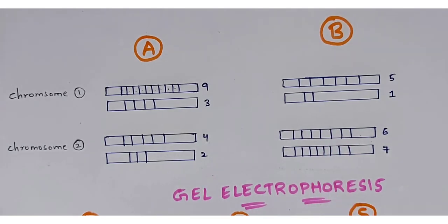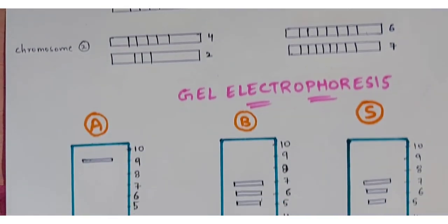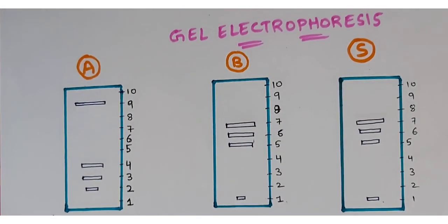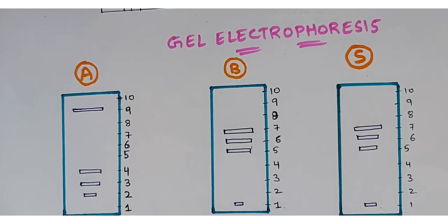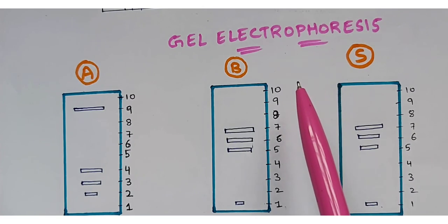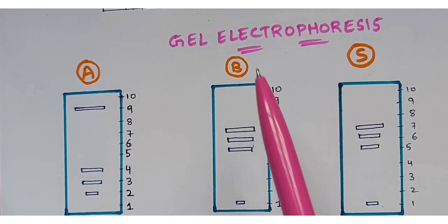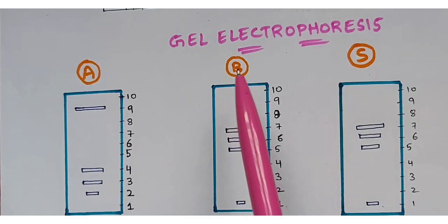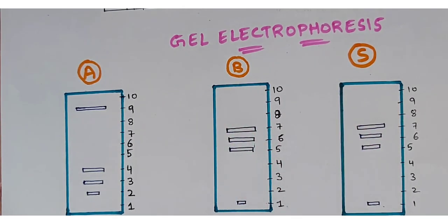Fine. So this is the isolation of the genetic information which you have taken from Akshay as well as Sandeep. Now what are you going to do? You are going to perform the gel electrophoresis technique. This is very important to remember. In the process of DNA fingerprinting, what is the technique which you are going to use? Gel electrophoresis. Okay, this might be asked in your examination, so please try to remember. In DNA fingerprinting technology, the technique which will be used is called gel electrophoresis.